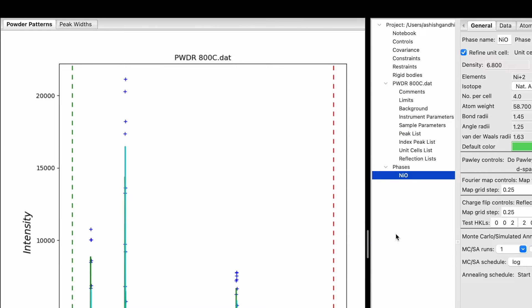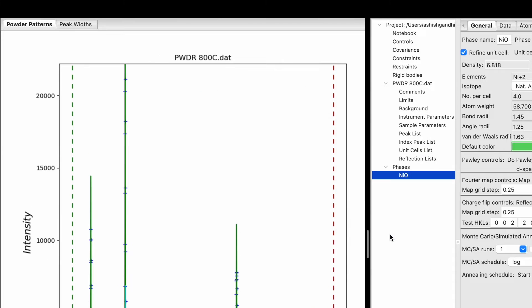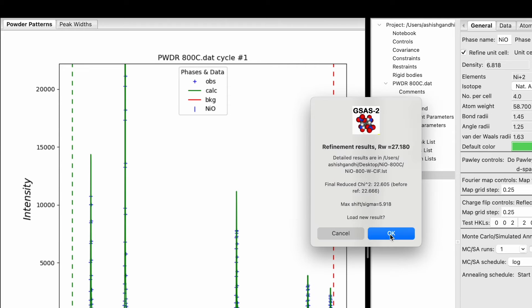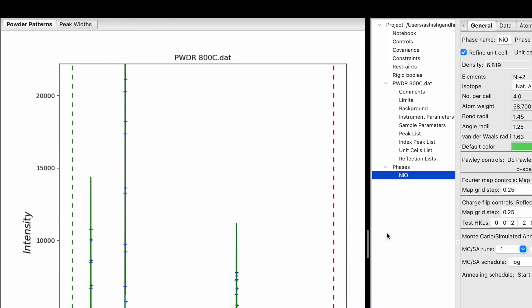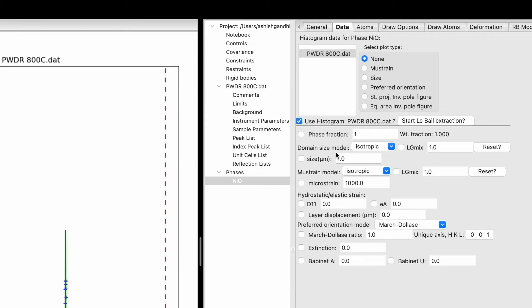Repeat again — hit Command+R. Now it's down to 29. One more time with Command+R — 22. It's not getting better. Click OK. Now we need to choose other parameters to refine.